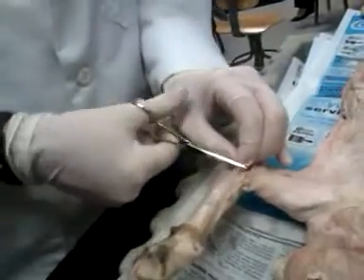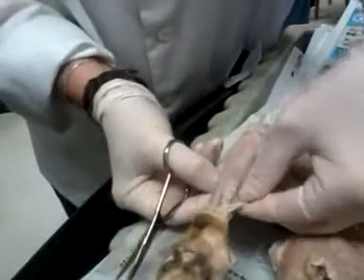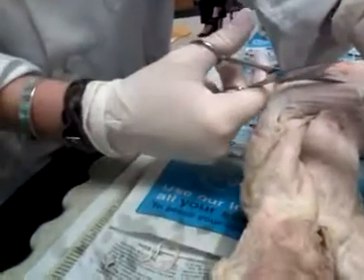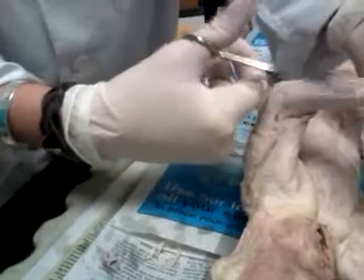This is the hardest part, getting this off. But do you see me getting this off? Yeah. Now, once you get this off, your muscles are going to say, here I am. See, look how beautiful they are. But you got to get this. It's hard, too, buddy. See the muscles? Mm-hmm. And look, you can even see where to separate them. So once you get that off, you just take this, like this. Just run it up under there, get that connective tissue, and this will pull right out. What I would do is cut right here, and then just expose them. Okay? All right. What are we writing?